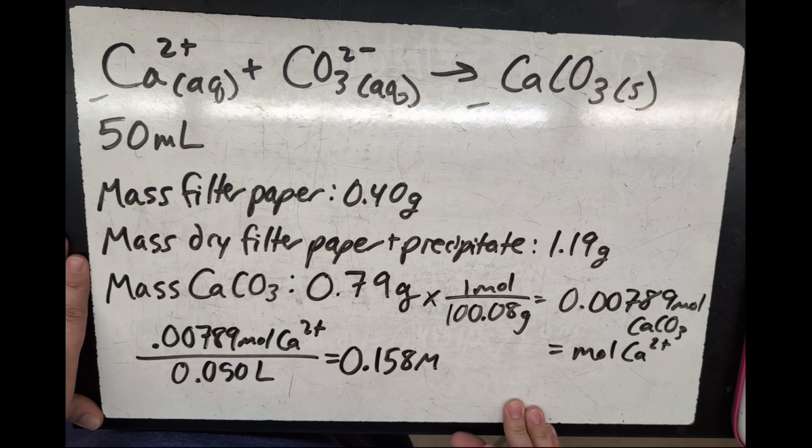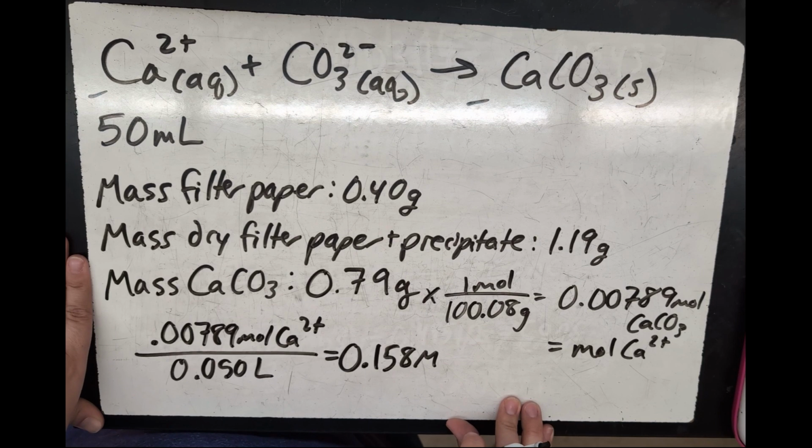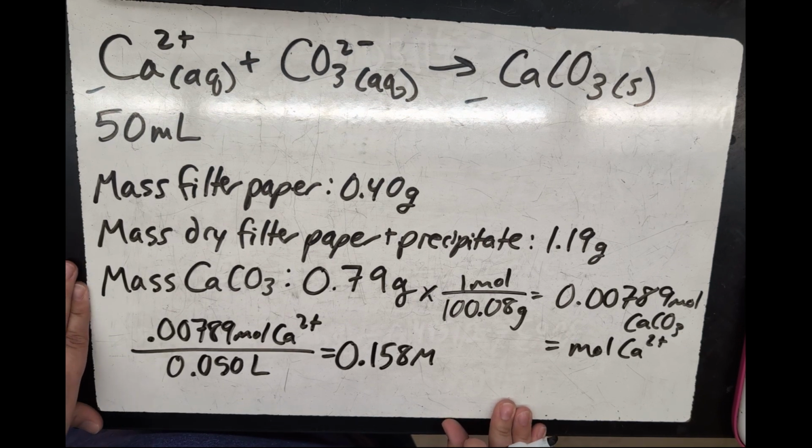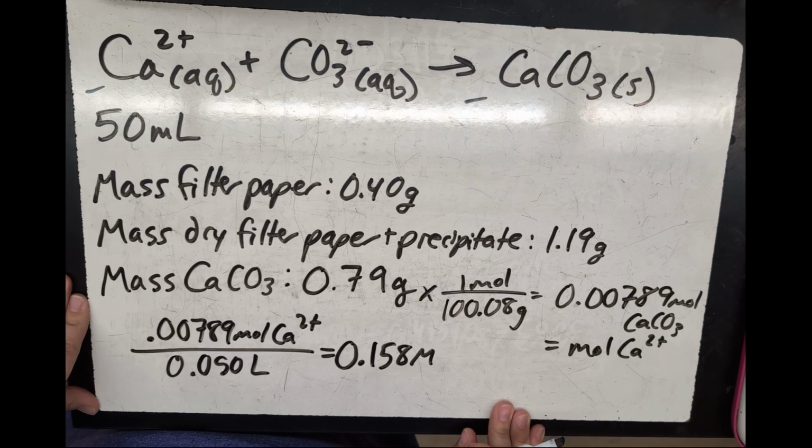But this is just a really nice way to practice gravimetric analysis procedures, and then relate that to a real life scenario where water softeners are definitely something that some people will need depending on where you live due to the hard water problems. It's also a good time to talk about boiler scale and how the scale can build up in pipes, why you would need to descale things like your coffee maker where the hard water might be running through, things like soap scum, a lot of interesting conversations that can relate the chemistry to the real world.